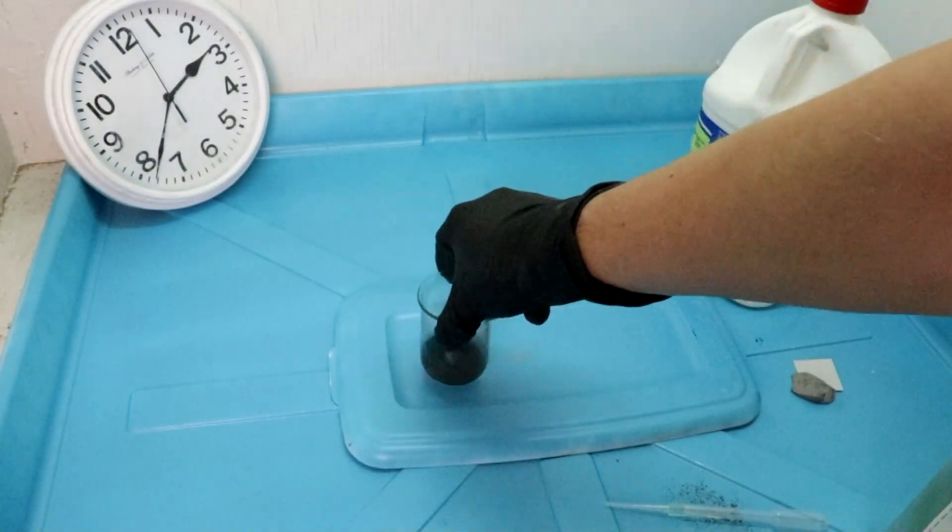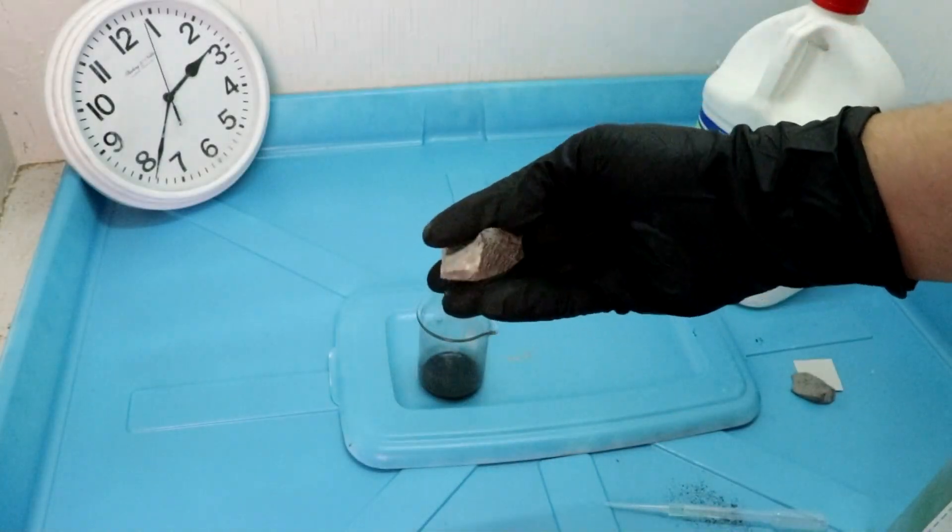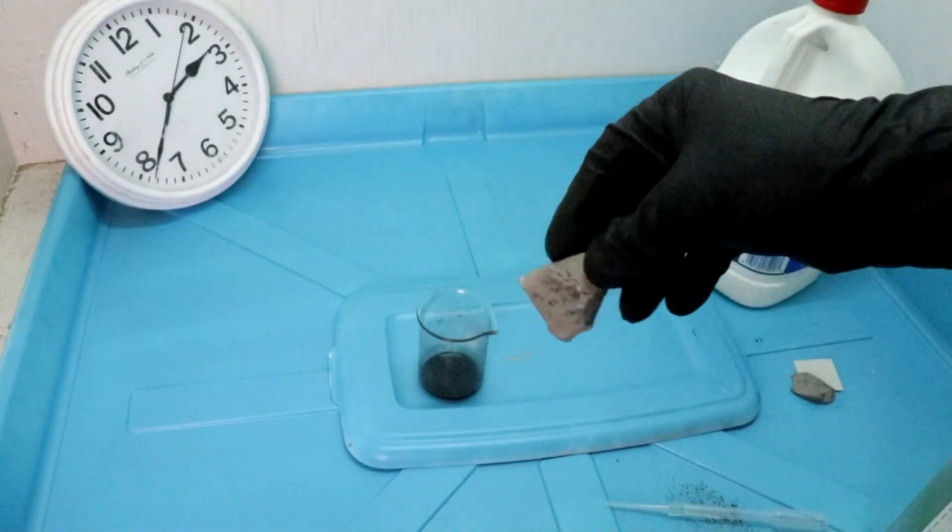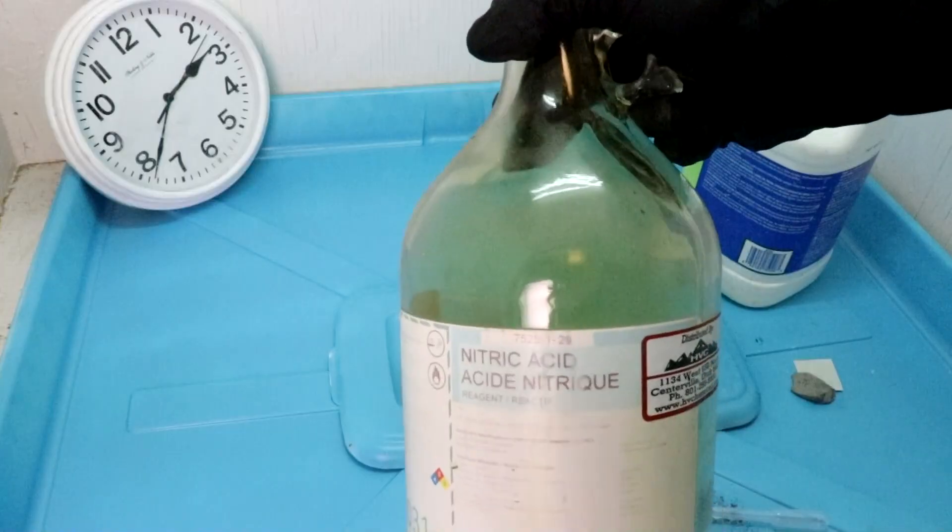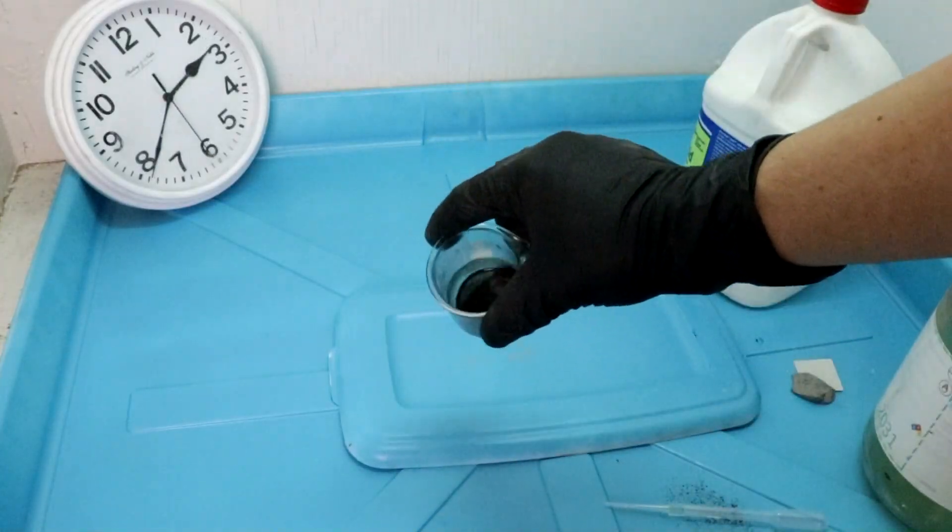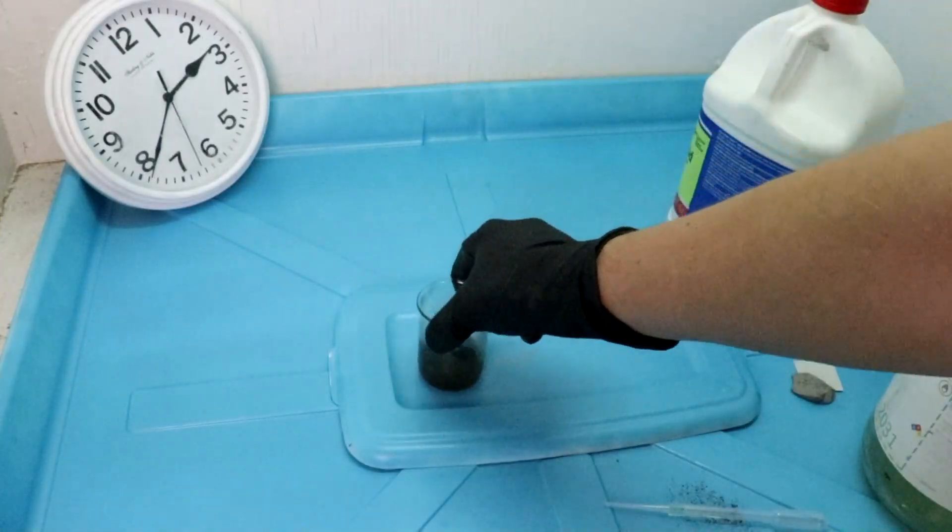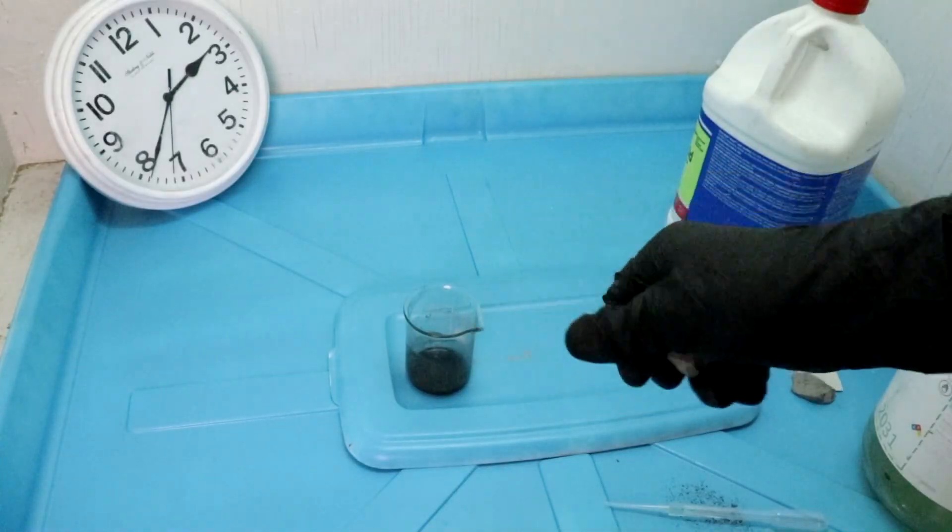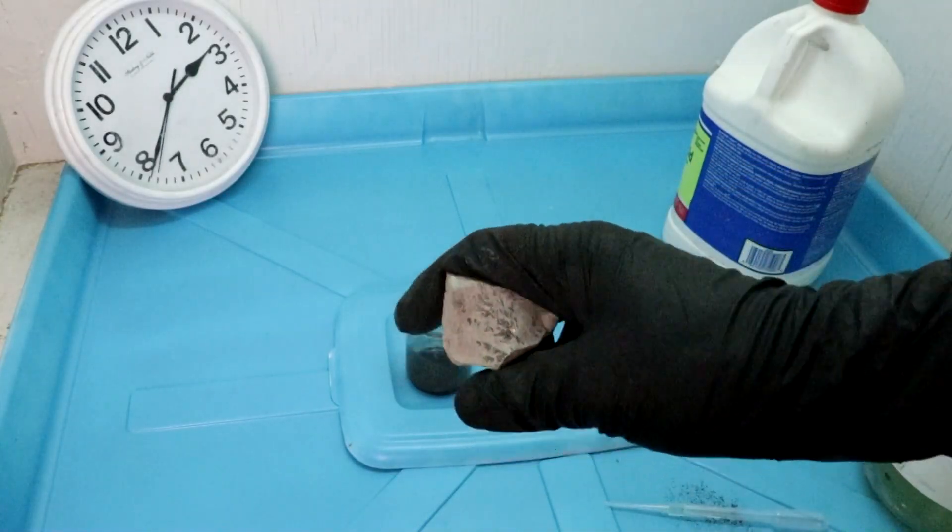The reason that the gold dissolved is that the manganese dioxide in the pyrolusite here is a strong oxidizer in itself, and so it actually acts as a replacement for the nitric acid. The manganese causes the chloride ions to be converted into elemental chlorine, which when combined with hydrochloric acid dissolves gold.